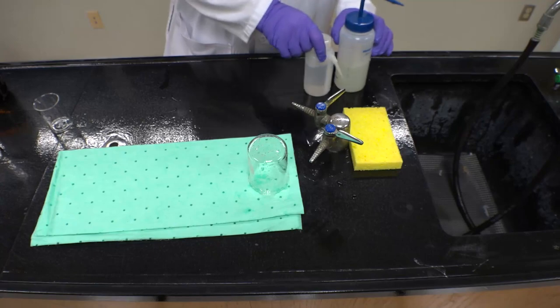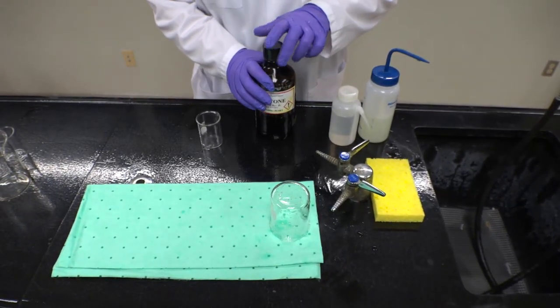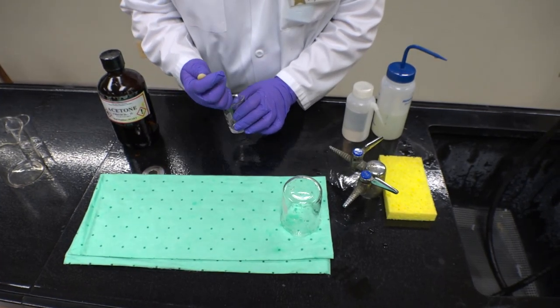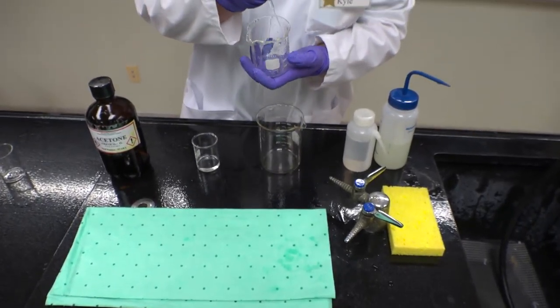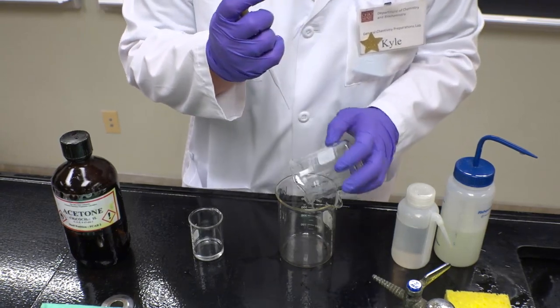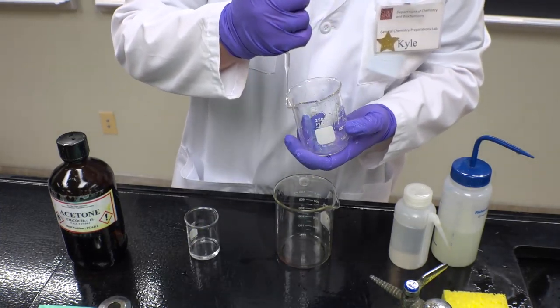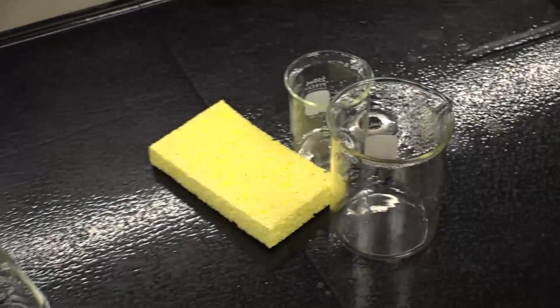If you need to have your beaker dry in a hurry and you have acetone at your disposal, you can rinse the beaker with a little acetone to help speed up the drying process. If you rinse your beaker with acetone, be sure to dispose your acetone properly. This technique is safe for most glassware.